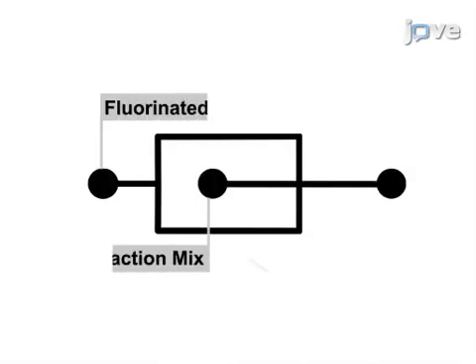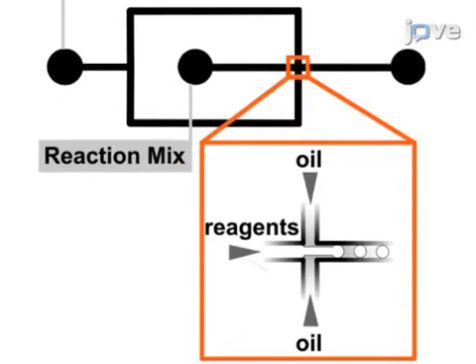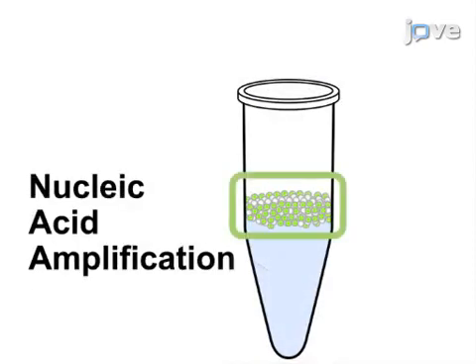This is accomplished by first preparing amplification reactions of the samples of interest and two standards, and forming droplets to partition each into thousands of nanoliter-sized reactors. The second step is to incubate the droplets to amplify the nucleic acids within each droplet.